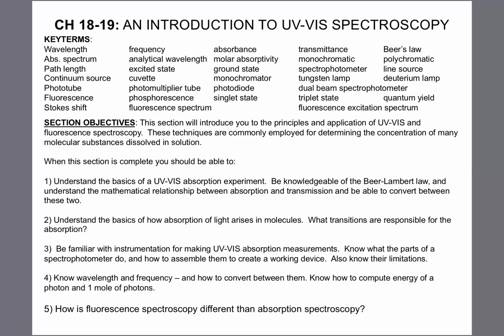Okay, so we are ready to start chapters 18 and 19. I'm grouping these chapters together. You can read through them as you study through your textbook. These two chapters are really all about ultraviolet-visible molecular absorption spectroscopy, short UV-vis spectroscopy.